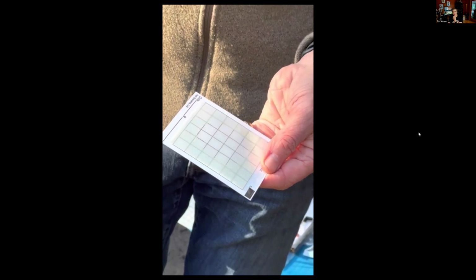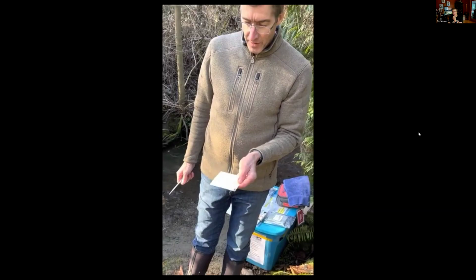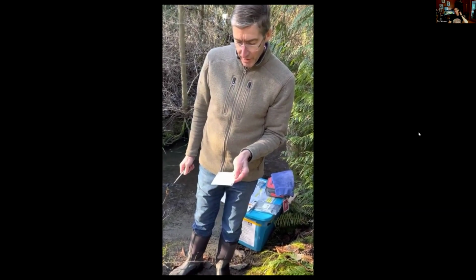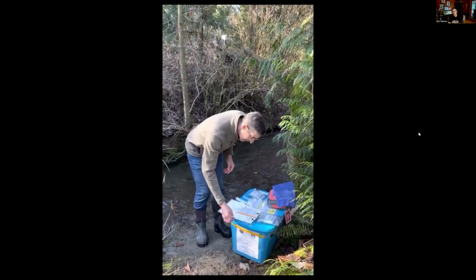So for the last sample, what we're going to do is demonstrate pipetting directly from the creek and then putting it on your R card. So this one I think is fairly safe right now. It doesn't seem to be traveling too much. So I can put this on a flat surface. Just let it finish kind of gelling, which just takes a couple minutes.